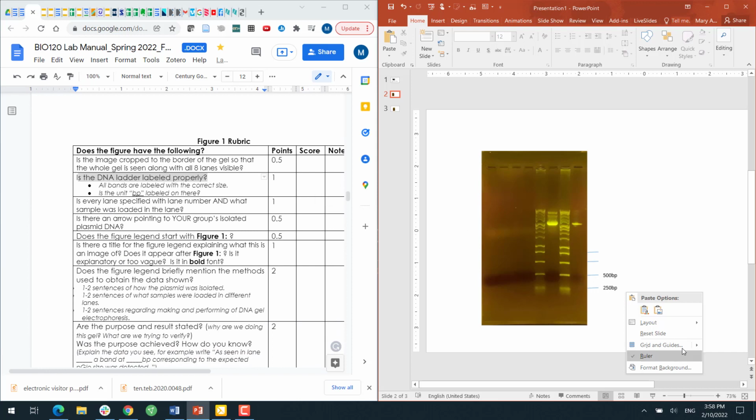I have finished this. I made sure they're the right size, they're base pair. So you need to do it for all of this. I'm just not showing you guys on every single one of this, but you can do that on your own.